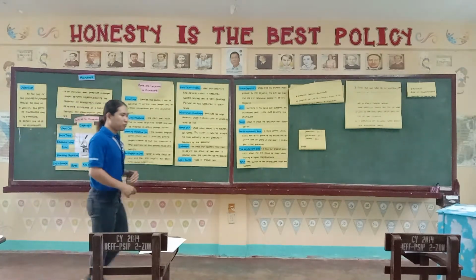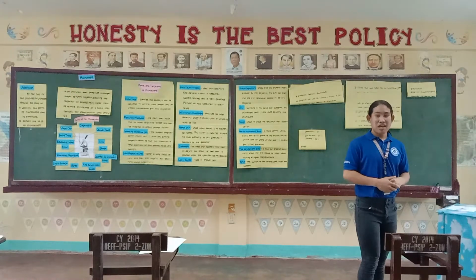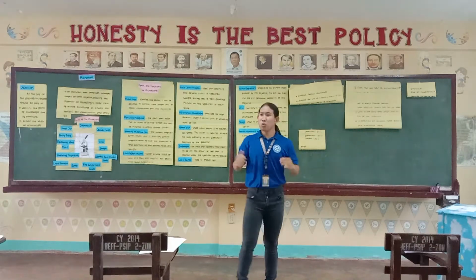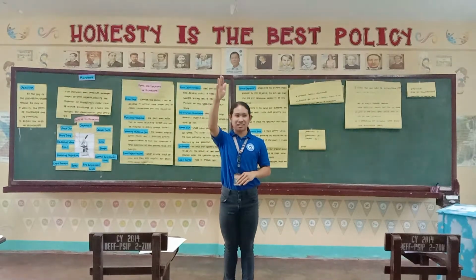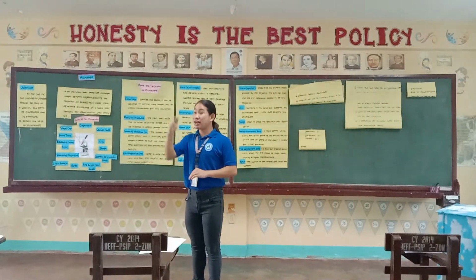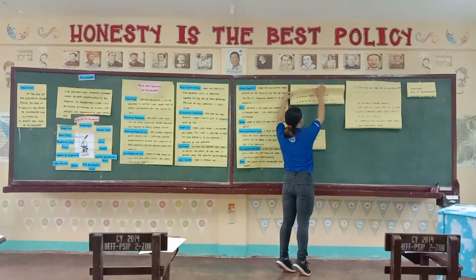And now, is there anyone in the class who knows the different uses of a microscope? Since you already know the parts, the meaning of the microscope, its corresponding functions, so what are the different uses of a microscope? Anyone in the class? Any idea? Yes, Mr. Sumalpong? Alright, to magnify cells or to study cells. Okay, that is one use of a microscope.